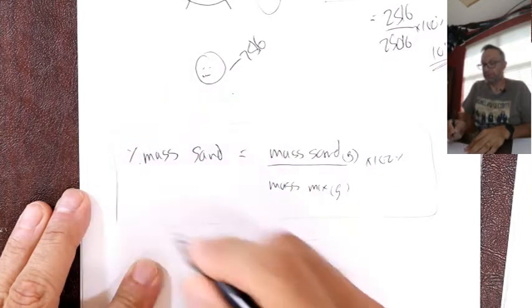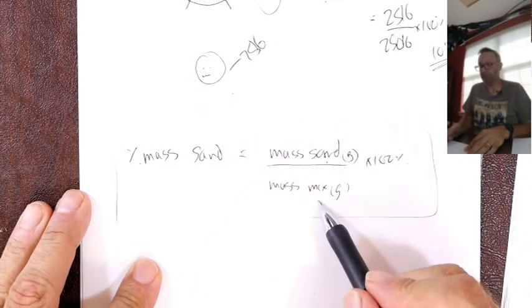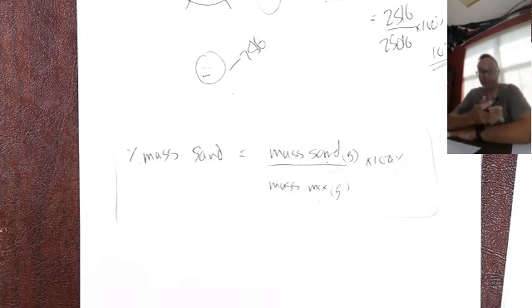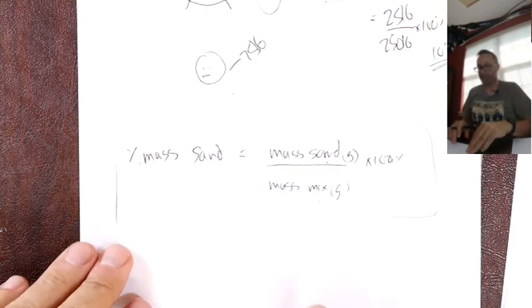You can be generic. Instead of sand, you could have salt, so you'd weigh the mass of the salt compared to the mass of the mixture times the 100. In our 3-component mixture, we have 3 things, not 2, so you'd work it out 3 times. In our binary mixture, we call it 2 things, you work it out twice. Okay, so that in essence is how you work out percent composition by mass as a percent, right?